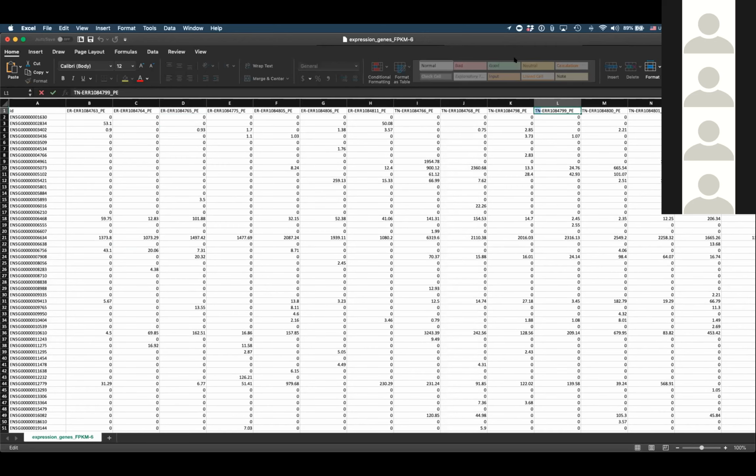So let's take a look at some of these things. What are XLOCs? Just again, XLOCs are unidentified sequences. They were not found in the GTF file, but Cufflinks that we used here still assembled them into some kind of a sequence that looks like a gene. In this specific project, the reason why you're seeing a lot of XLOCs is because the reads were artificially prepared so that the processing time of the reads takes a smaller time.